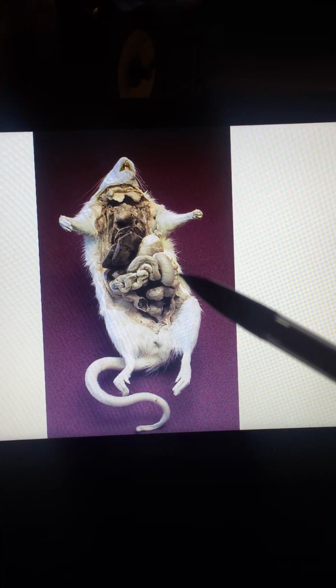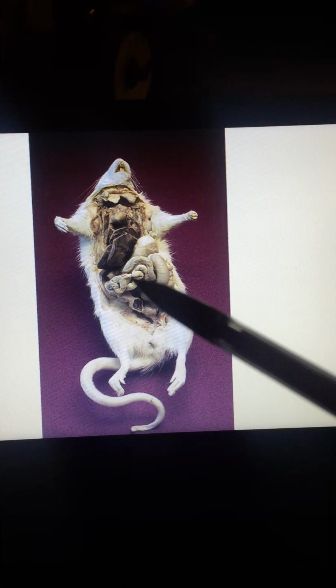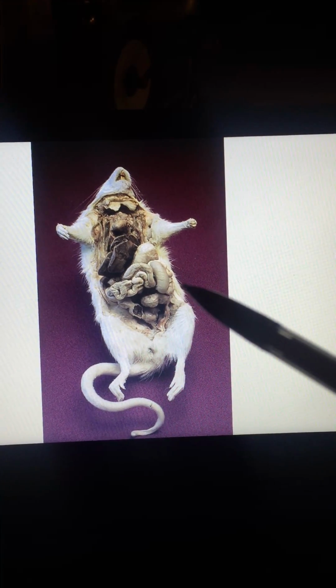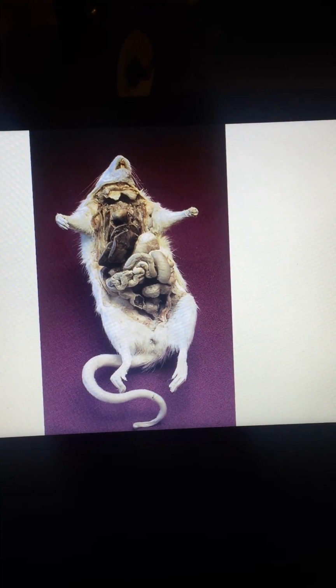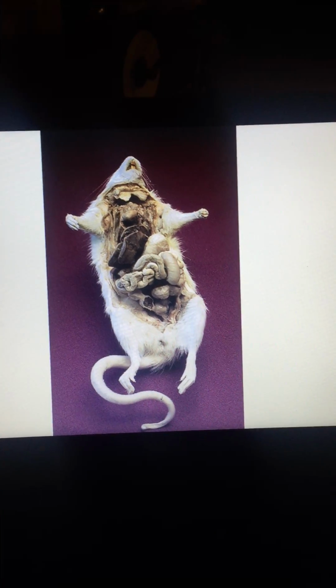It's going to look like a thin, tongue-like flap. It's skinny, it's red, literally looks like a tongue wrapping around the side of the abdomen of the rat. And the job of the spleen is to help with your immune system and also red blood cell function.